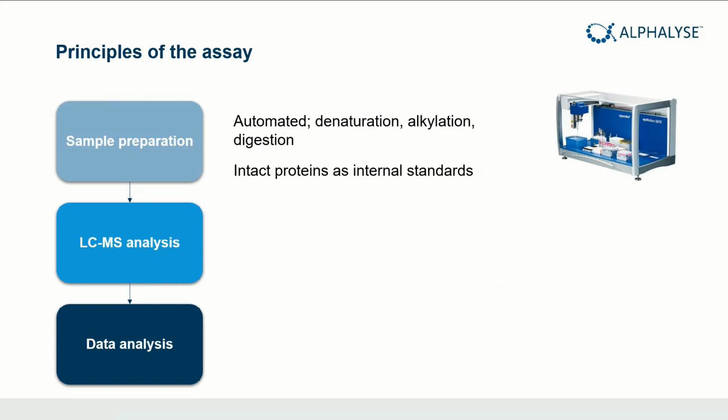We add intact proteins and we use these as internal calibration standards, both as QC standards and for calibrating the amount. These proteins we add into each sample before we start any sample treatment. So they will take into account any variability in the sample preparation step.